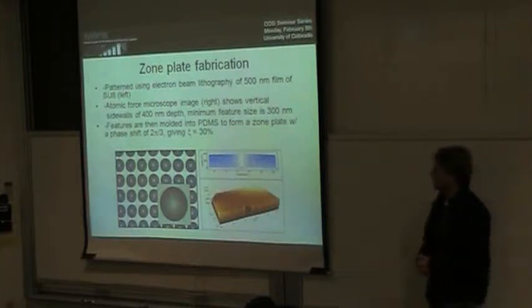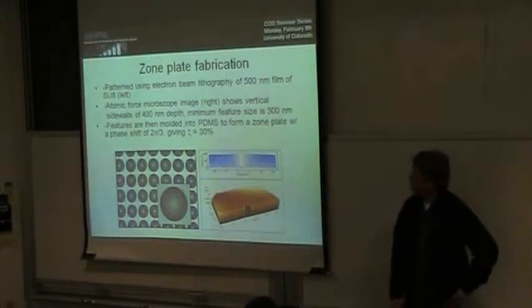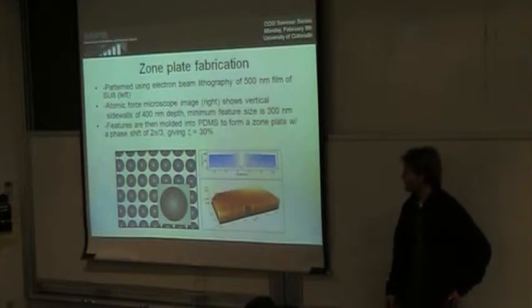Okay, so this is a slide about the fabrication. What's cool is we can make these zone plates with the same procedure that we make the microfluidics.